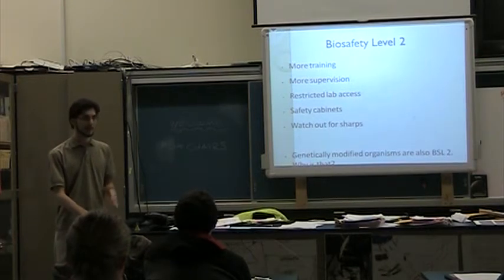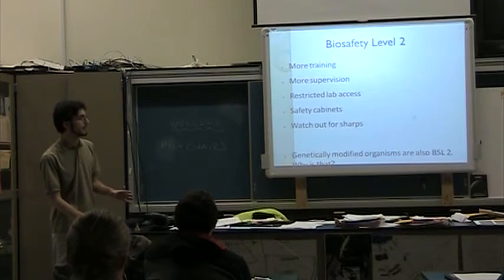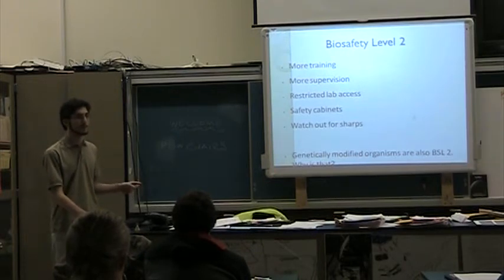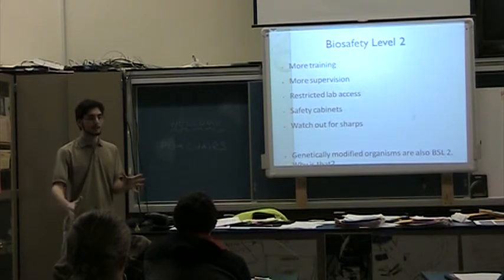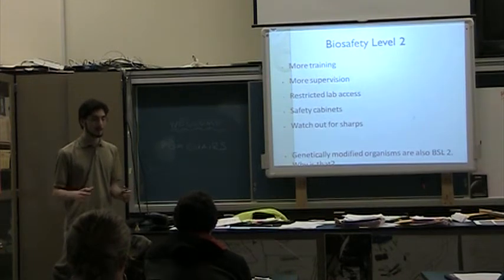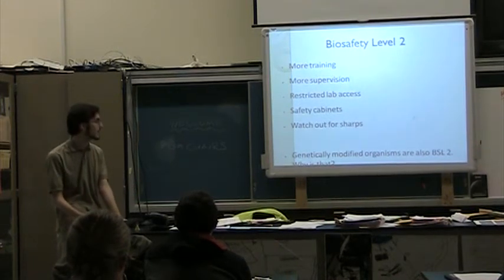And safety cabinets, which I'll talk about a little bit. Safety cabinets are essentially a self-contained laboratory setting, a box in which you can work with samples without any risk of them spreading around the lab.